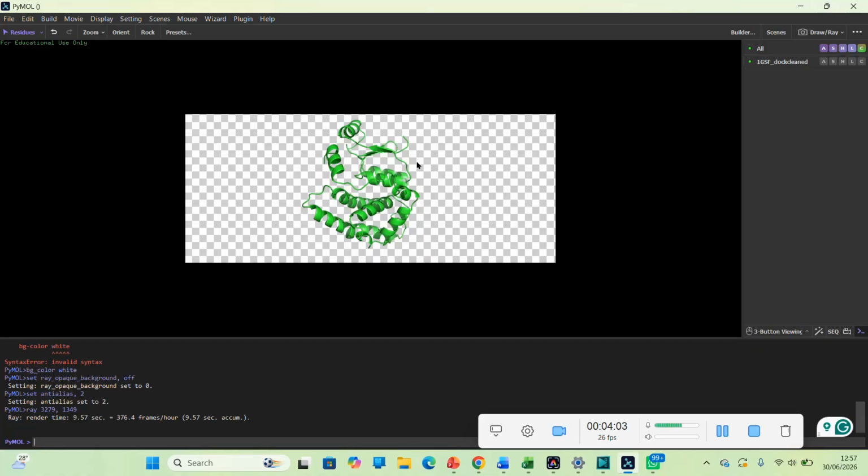So if you are going to try your hands on something, okay, let's just even try it here. Let's retain the height, which is good enough. Let's take that. But remember, we are also aiming at 300 dpi. But I would just do this to see how it works. 2500 instead. Sorry. Ray 2500, comma, 1349. Then run. We'll give it time again to see how it affects the outcome.